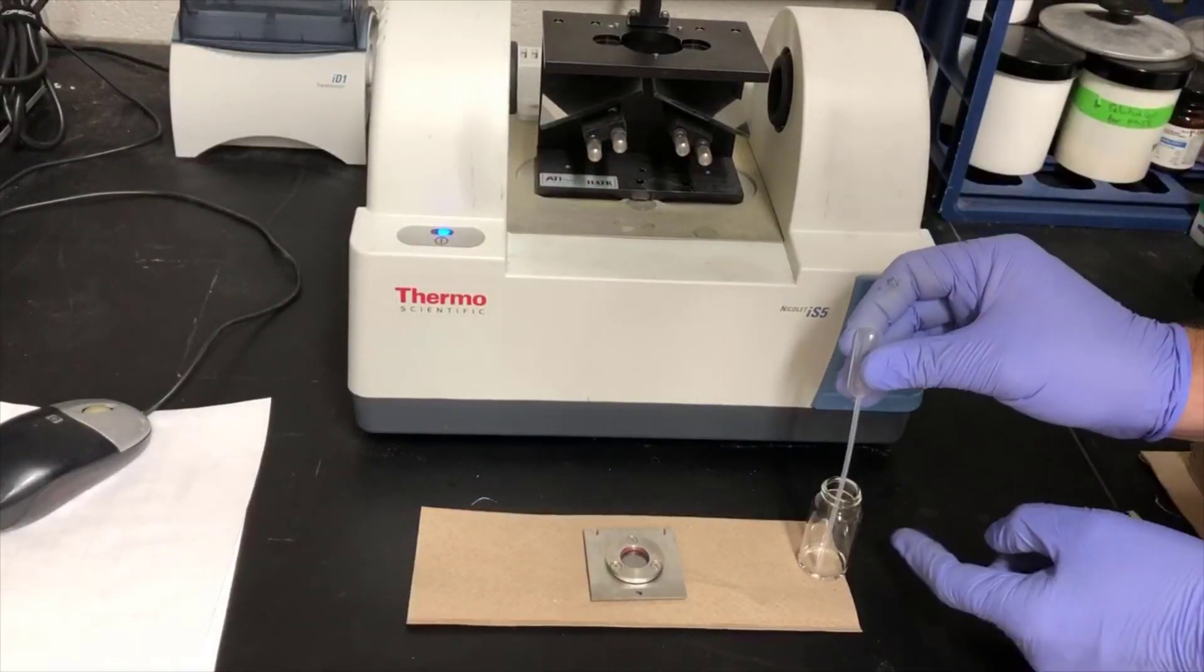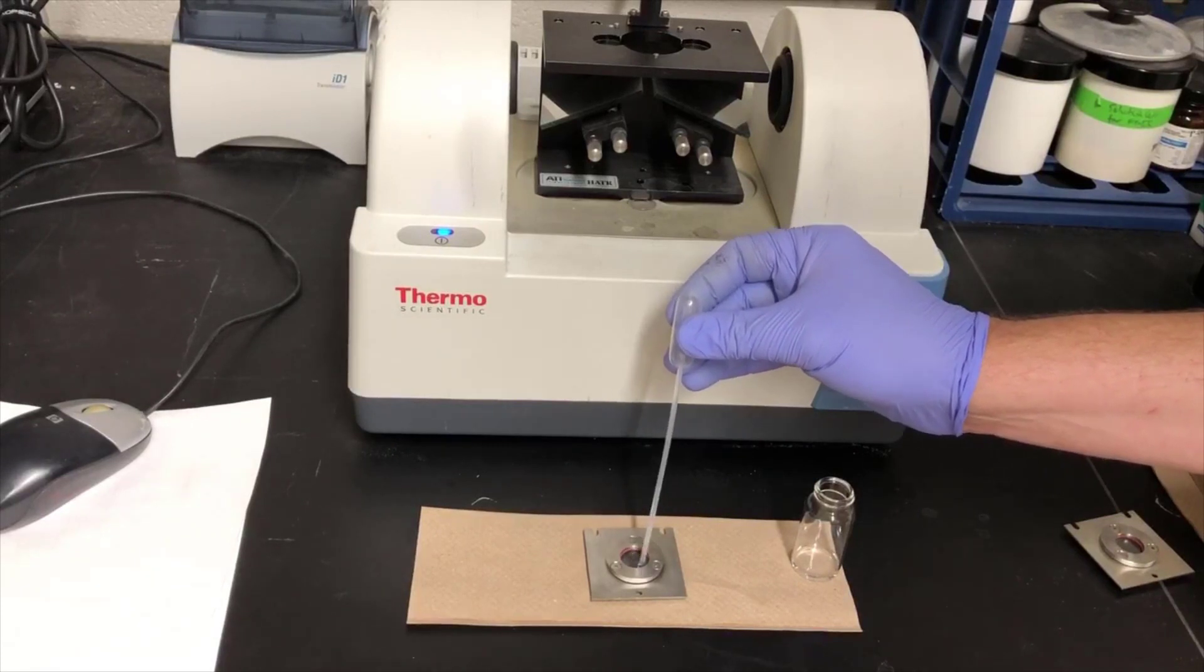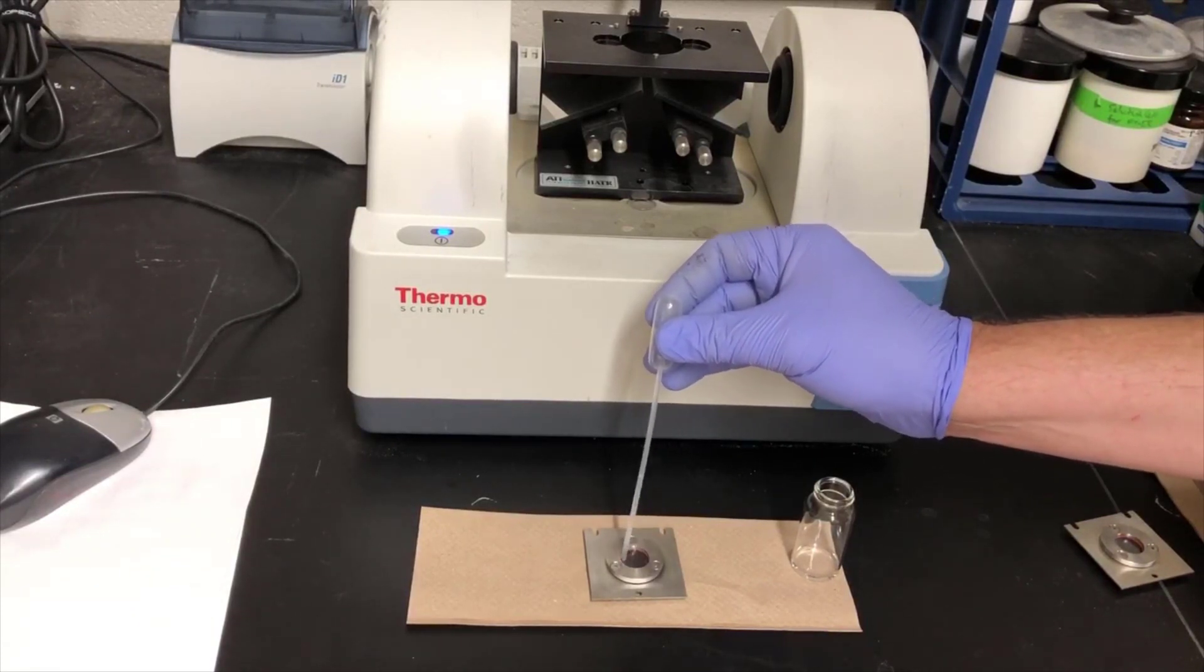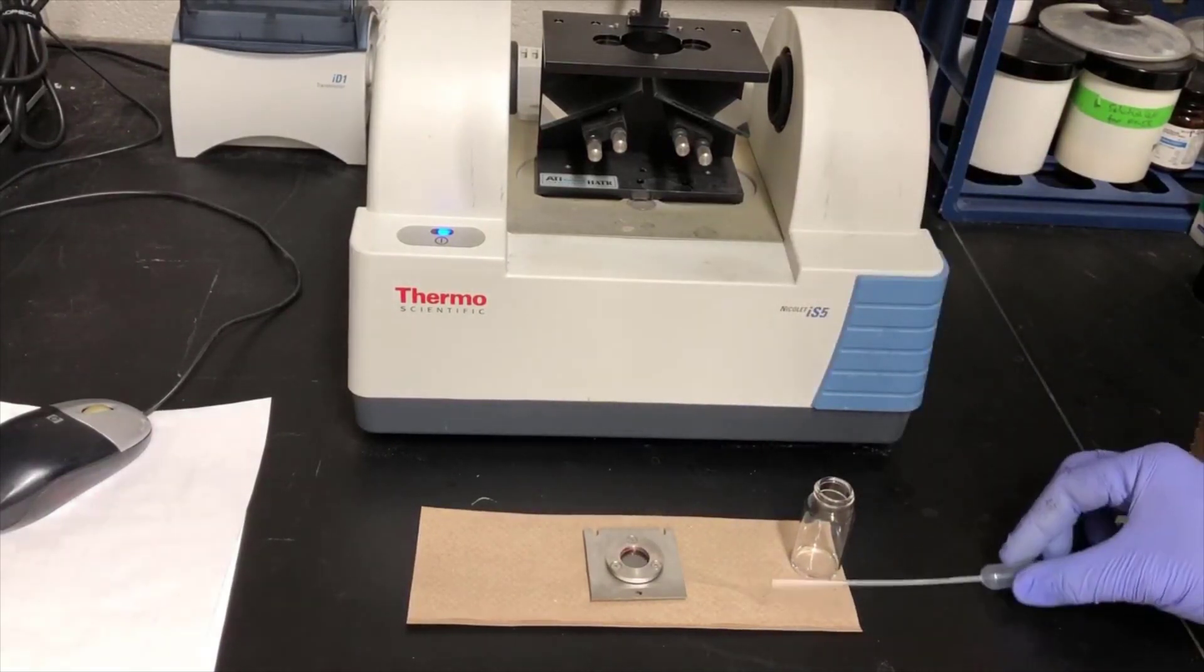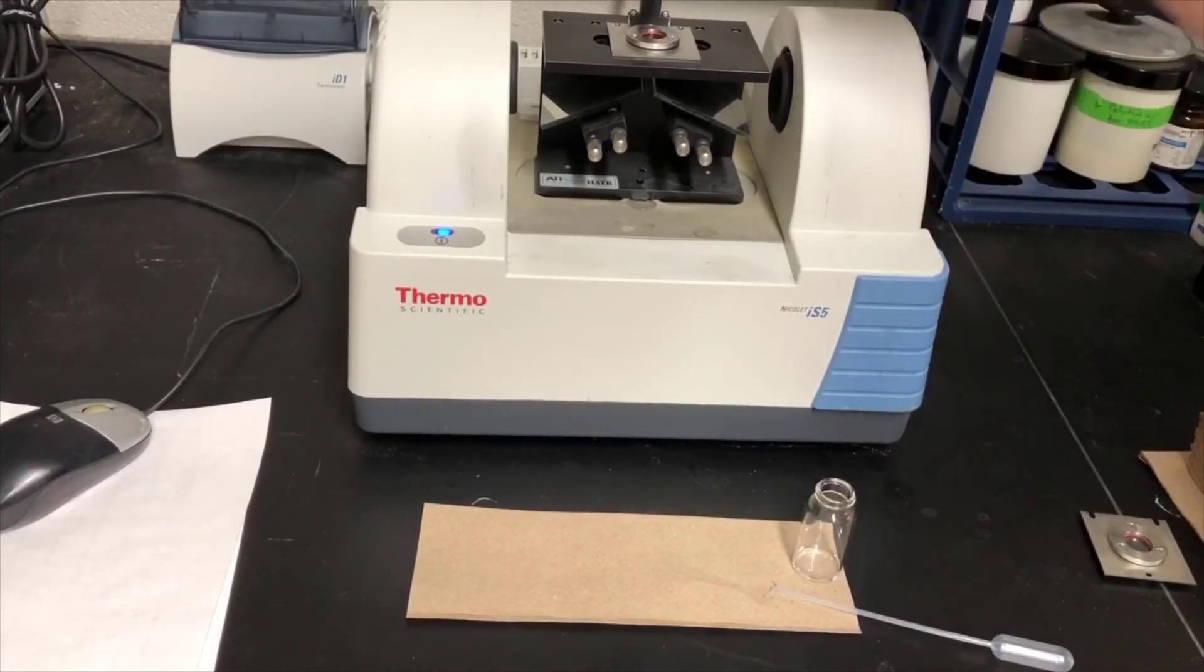Using the IR spectrometer was covered pretty extensively in another video, so you should definitely check that one out if you haven't already, or you're a little fuzzy on how to use the machine. Here I'm painting a little bit of the sample onto an ATR crystal, and I'll put that on the spectrometer and acquire scans.